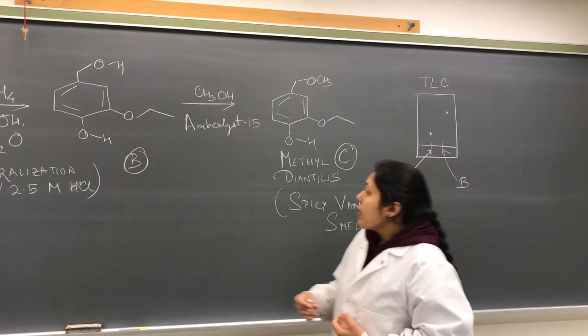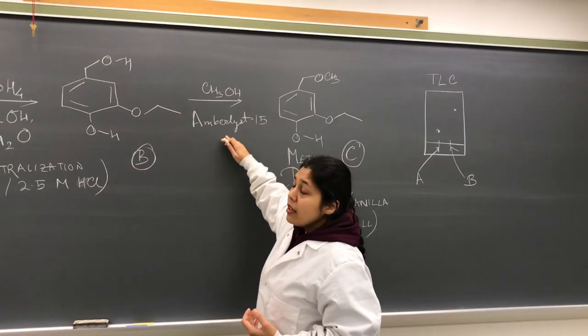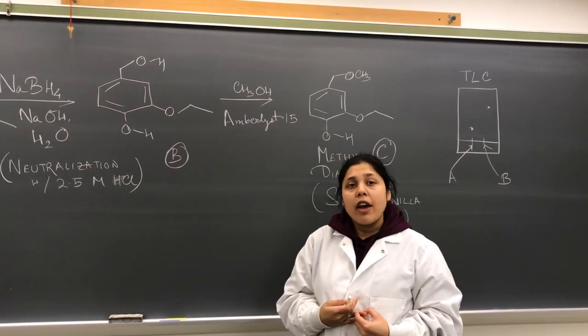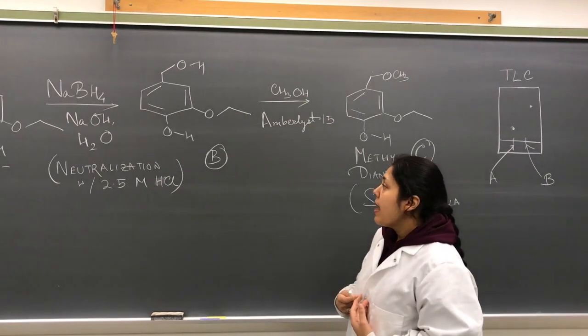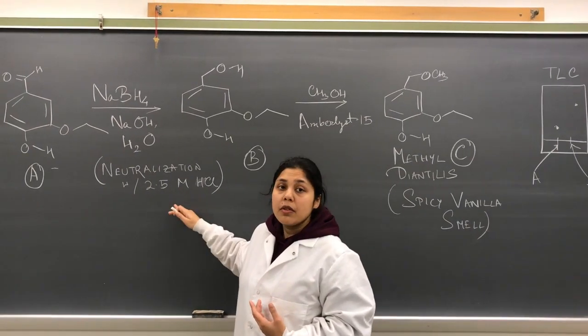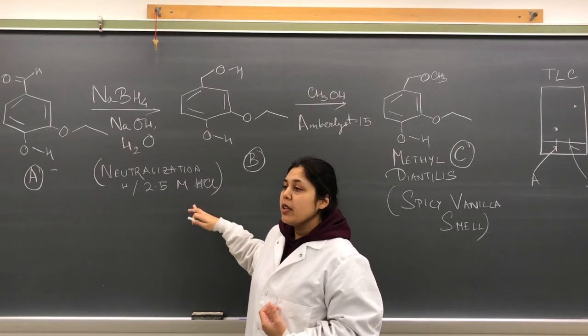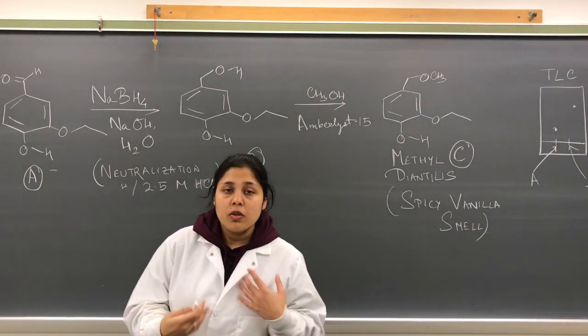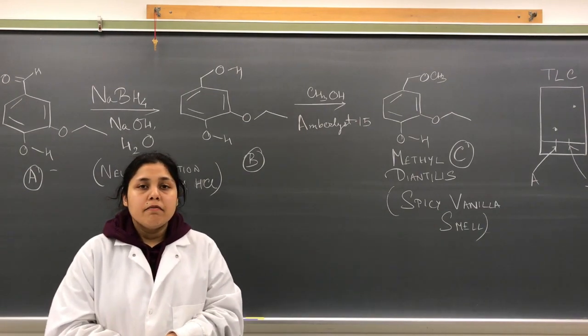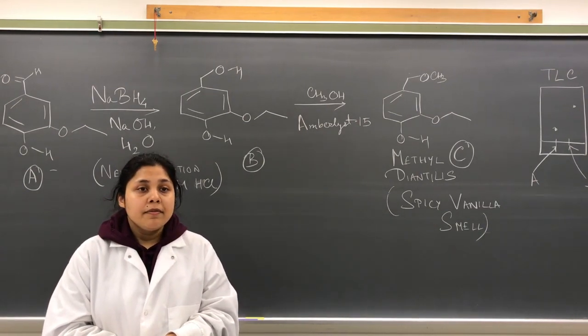Yes, so we have to be careful about certain things. This catalyst can become very dry very quickly, so while weighing it out, we have to weigh it out very fast. And this neutralization step is crucial. Be careful with the HCl and with the white froth. You don't want it anywhere on your clothes or on your hands. And that's about it.